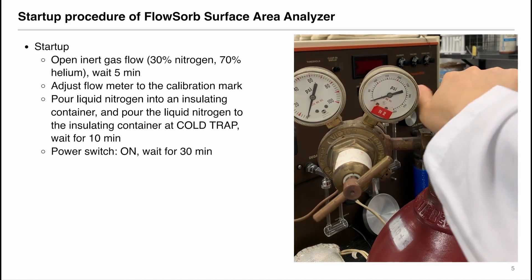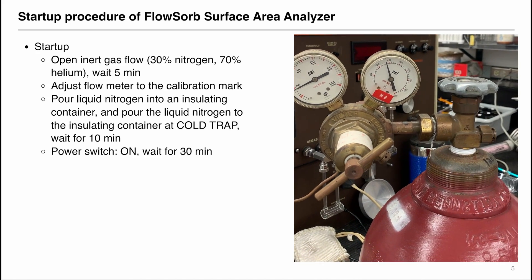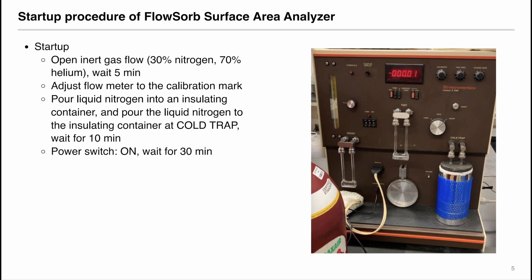When starting up the instrument, first open up the inert gas flow with 30% nitrogen and 70% helium. And then wait for 5 minutes before doing anything to the instrument itself. Once the inert gas flow has been established, we can then adjust the flow meter to the calibration mark. So here is the knob that we will be adjusting. We want the bead to be positioned at the calibration mark.